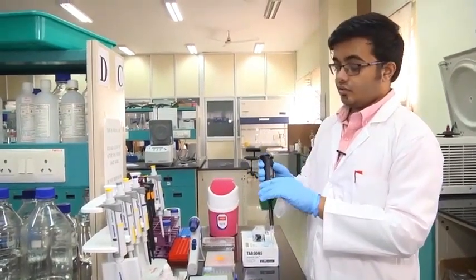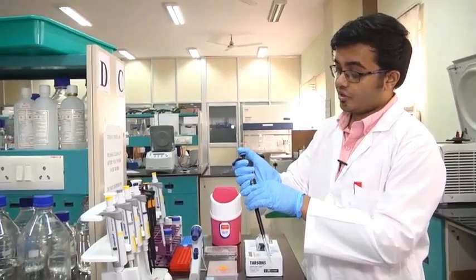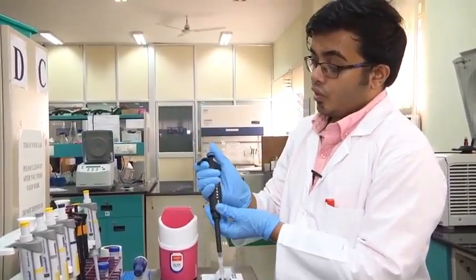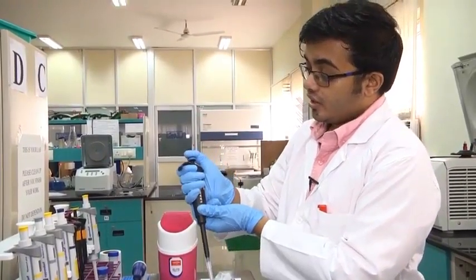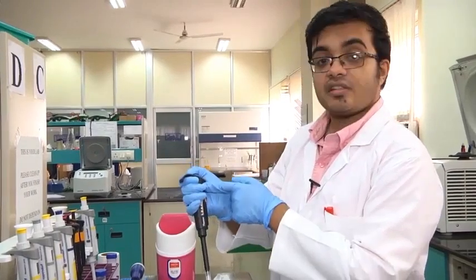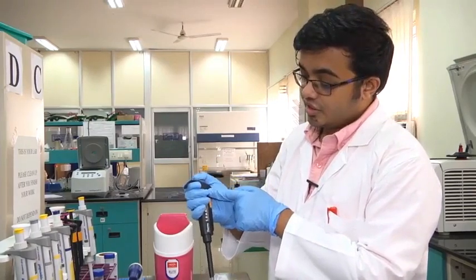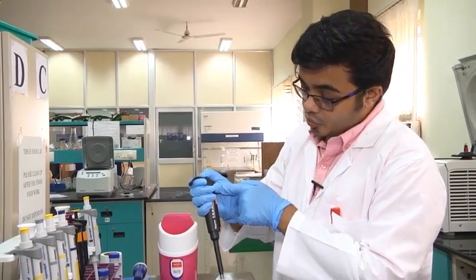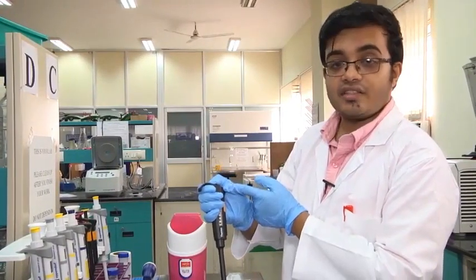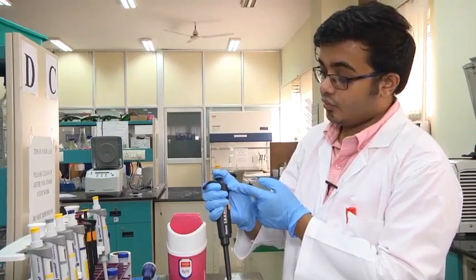Another thing that you need to know is this piston can go up and down depending on the pressure that I exert with my thumb. When you're using a pipette, you will notice that as you keep exerting pressure, the piston keeps on going down until it meets an initial resistance, which we call the first stop. Once it has reached there, you can exert a bit more force and go down until it reaches a second resistance, which we call the second stop. This is useful when we are dispensing liquids.